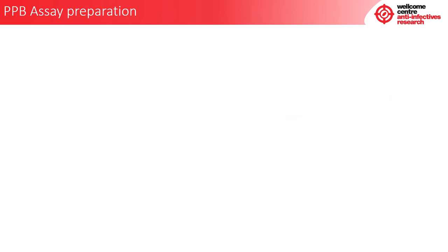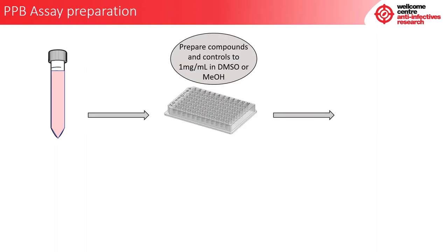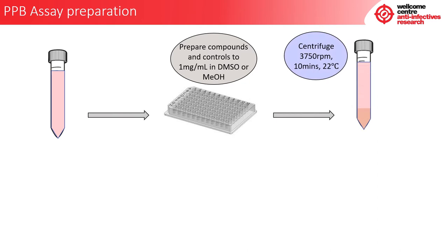Now it is the next day and we are going to prepare the PPB assay. First, remove your plasma from the freezer and let it defrost — this can take quite a while so it is advised to do this as soon as possible. While the plasma is defrosting, prepare your compounds and controls to 1 mg per ml in DMSO or methanol. Once the plasma has defrosted, centrifuge it at 3,750 rpm for 10 minutes at 22 degrees Celsius to pellet the fibrinogen.